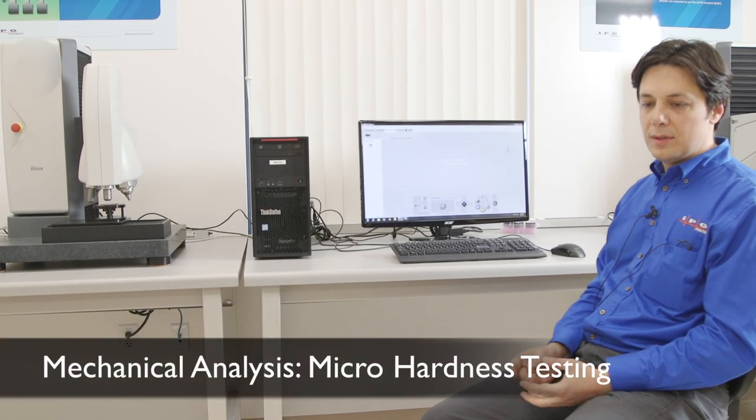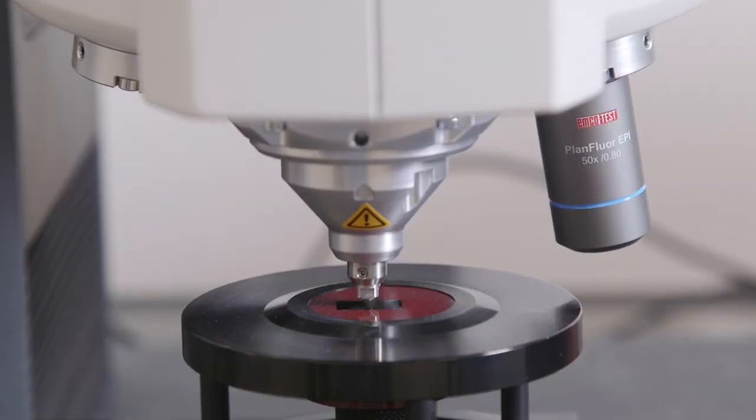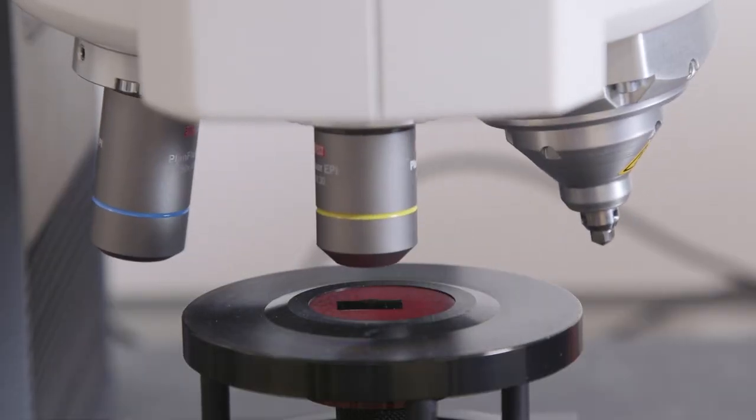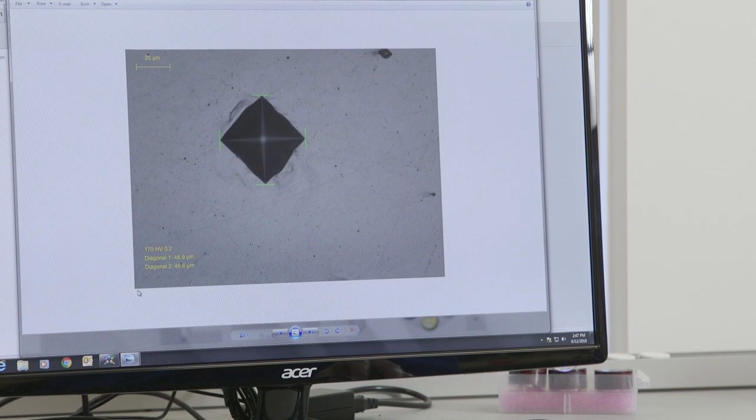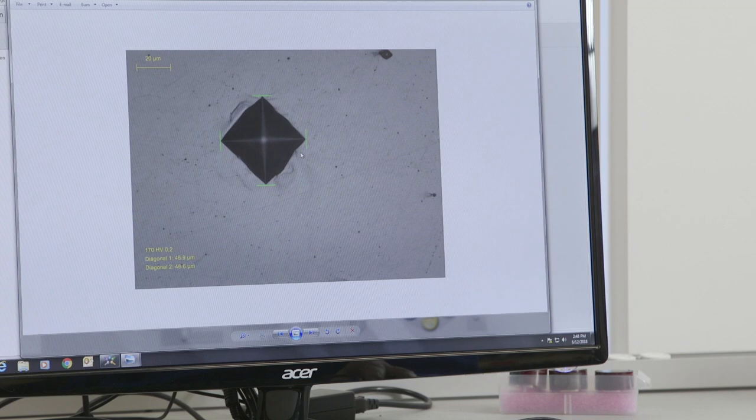In a micro hardness test, we use a low level of forces to create very small micro-level indentations. This is a Vickers micro hardness test performed on the weld zone of a process sample, and the size of the indentation is measured optically by the system.